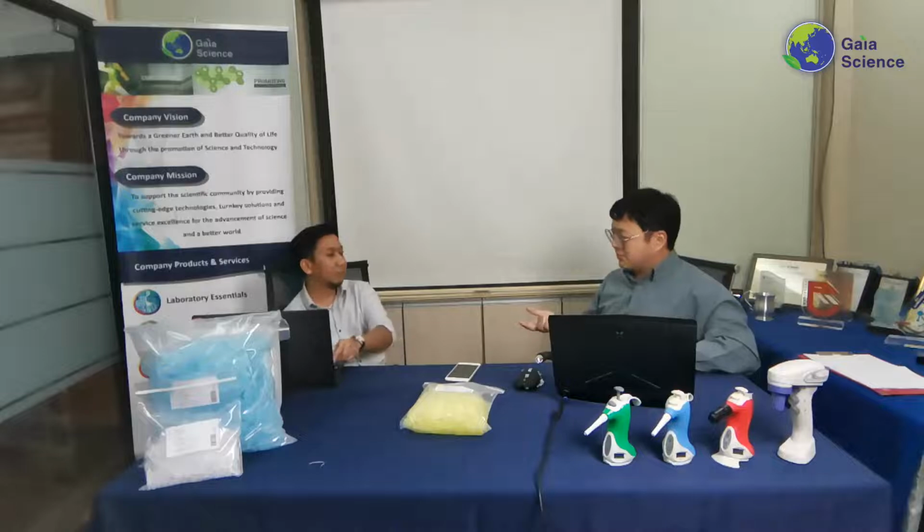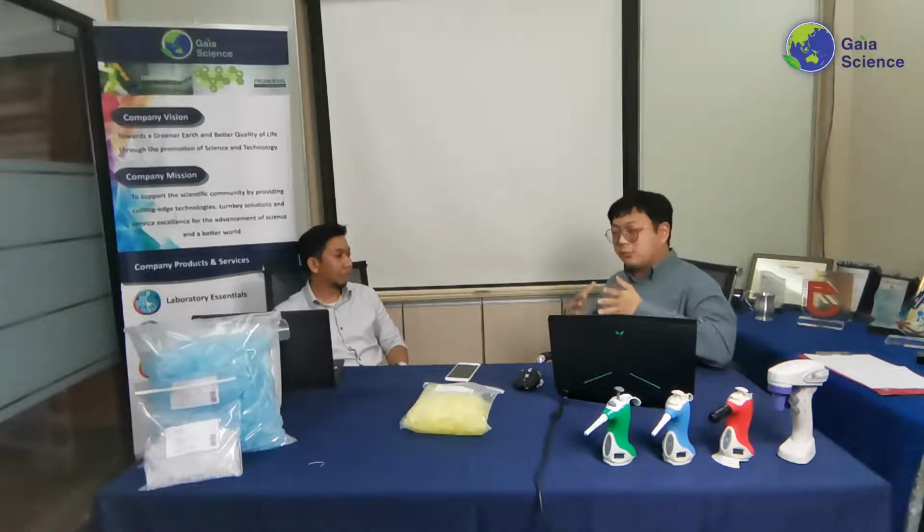But again, obviously with low retention, it's going to be more expensive than bulk tips. So make sure you know exactly what you're using them for. It's not like the typical tip that you normally get. It's normally used for PCR, maybe cloning or sequencing, or certain RNA and DNA applications as well. Or even SDS-PAGE or other protein analysis.